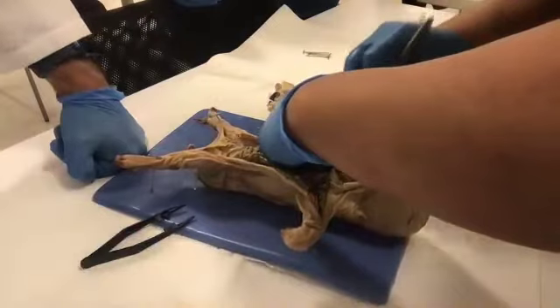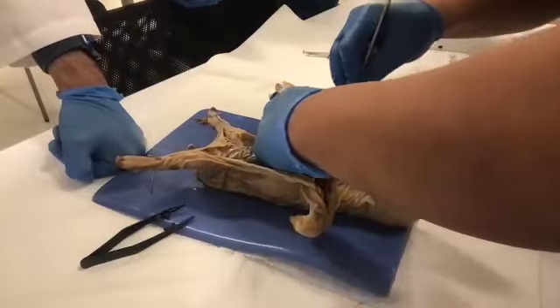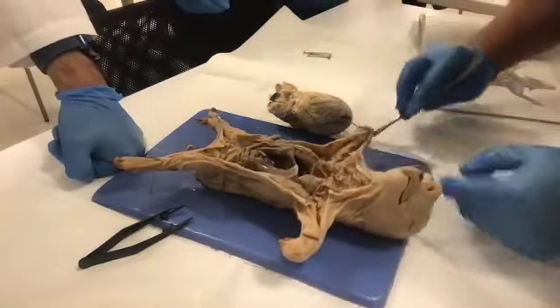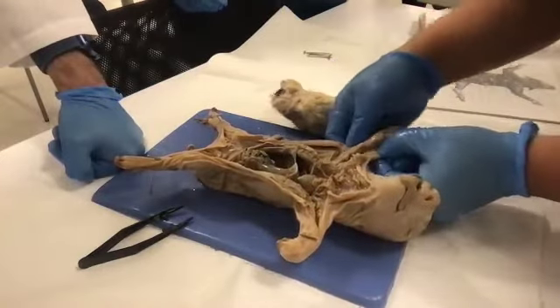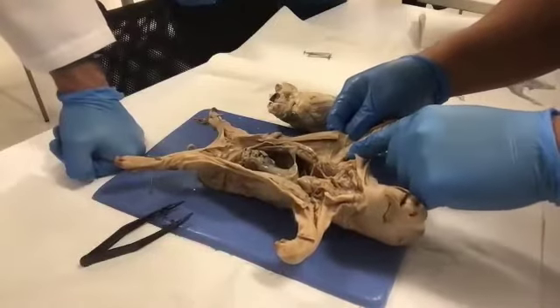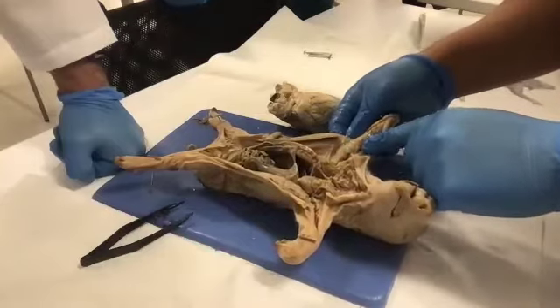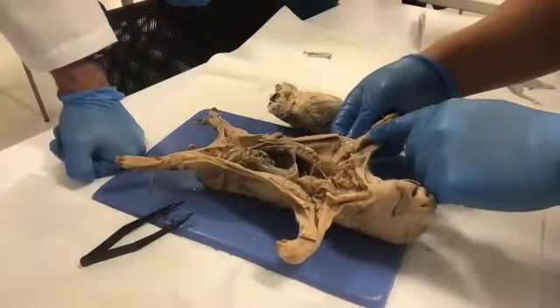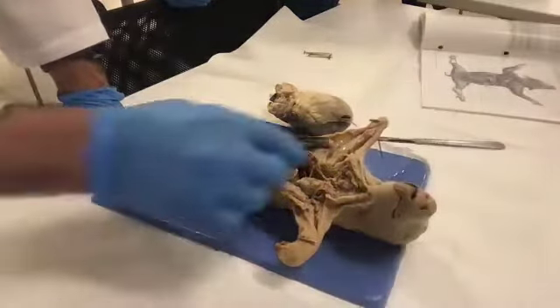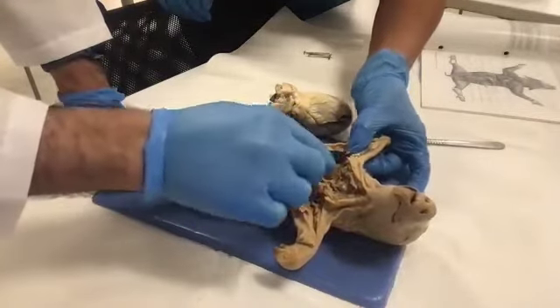Let's open it now to the knuckle. Okay. So if you see here, see these bands? You might not be able to see it at home, but there are bands here. And this is like the piggy's elbow. And there's a band. You see that? There's like white, and it's connecting from this muscle here to the bone. Feel it. It's tough. And that's a tendon.